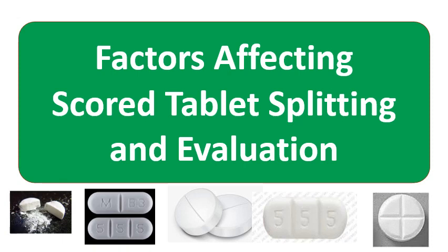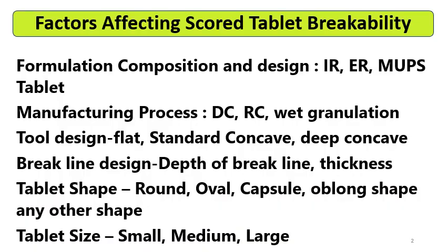Welcome dear viewers to the video on factors affecting score tablet splitting and its evaluation. In this video mainly we are going to have the understanding about the factors which have a great impact onto the tablet splitting and the tests which are required to be performed for the tablets having functional scoring, or you may say as break line.